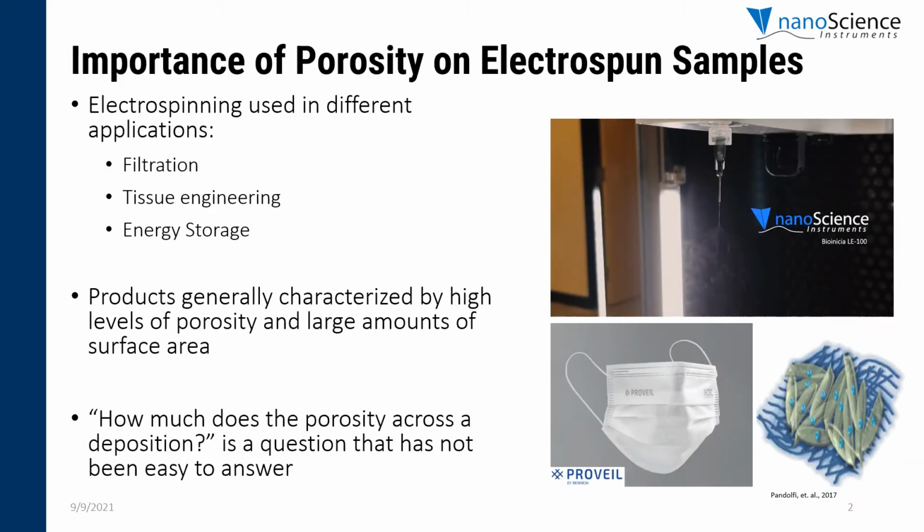The electrospinning technique is widely used thanks to its ability to produce nanoscale fibers, which allow for a high level of porosity and surface area. These are crucial for applications like filtration. For example, filtration masks where nanofibers must be able to prevent virus-bearing particles with a size less than 100 nanometers. Lacking control over porosity could cause life-threatening losses if the filtration efficiency is lost.